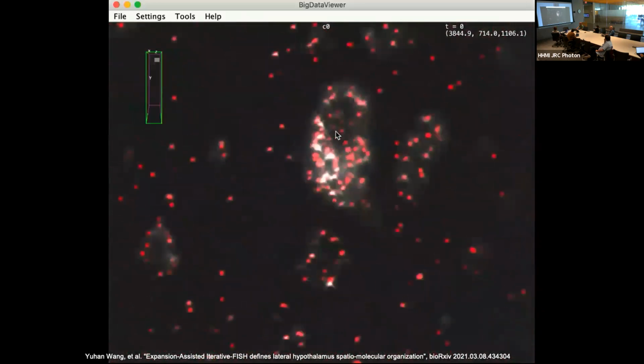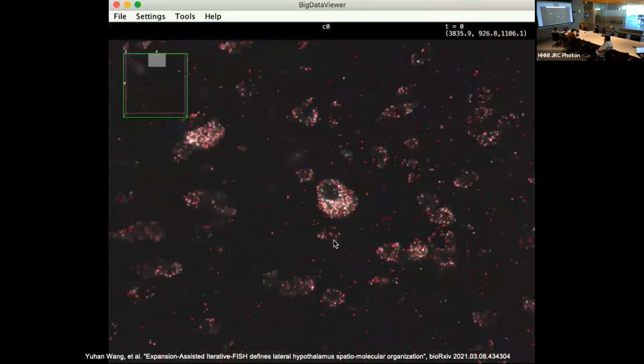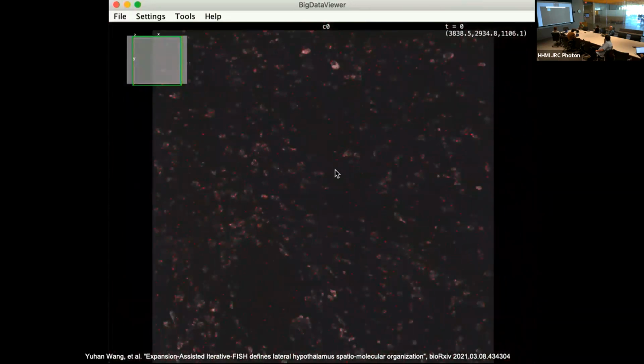So the red ones are obviously detected spots, right? Then you can basically see did this work, did this not work, which is very useful feedback because before you couldn't even look at the result. We've done the same thing actually with Tim's method with FishQuant. You can just visualize those spots as well. So I think it's also just a set of tools that you can basically use interchangeably.